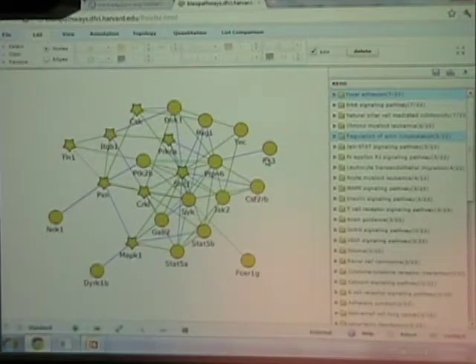These are the sorts of moves that you can make if your data is microarray based or genomic based, because you'll notice the representation here is gene centric. We're representing things as genes. I should point out we're making here a network based on known protein-protein interactions, and I'll show you in a little bit how to use this. Basically, if there's an edge between two genes, it's because we know that there's a known protein-protein interaction between them, and the color represents the source of that information. I'll show you how to mess with that in a second.